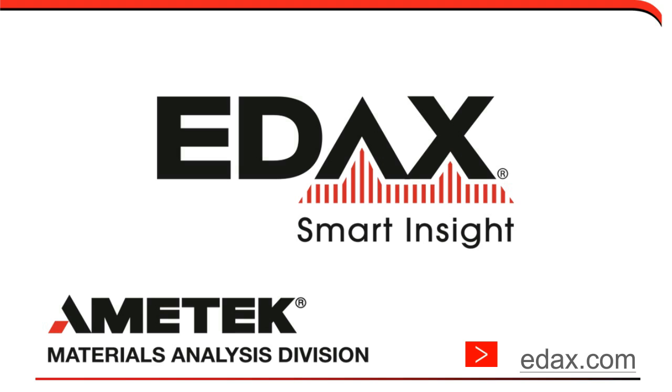We have one there that came in a little bit earlier. What are the sizes of the PRIAS images? Any number of pixels can be used for the images themselves, depending upon what the software options are that's selected. So if it's the pre-scale, it's whatever number that you collect for the electron image. If it's the post-acquisition, it's whatever the size of the OIM acquisition that you run. Typically, it's 256 or 512, but it could go higher or lower as needs arise.